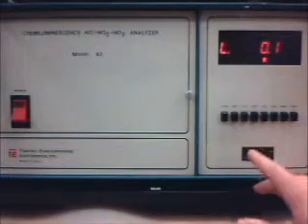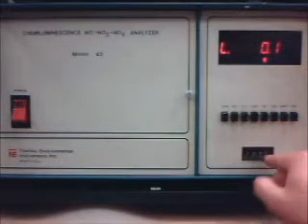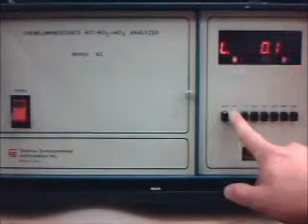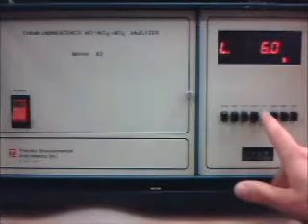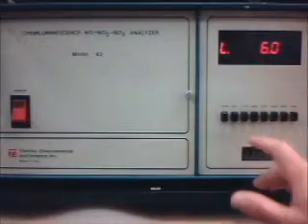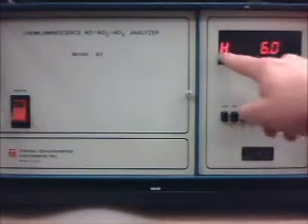So if we let it run for 3 to 5 minutes, then let's say 100 parts per million, I think is what I've dialed in. We hit enter, then it changes its value. If we hit it again, I thought it would change. Maybe we have to hit display. Okay, there we go. Now we see the H.